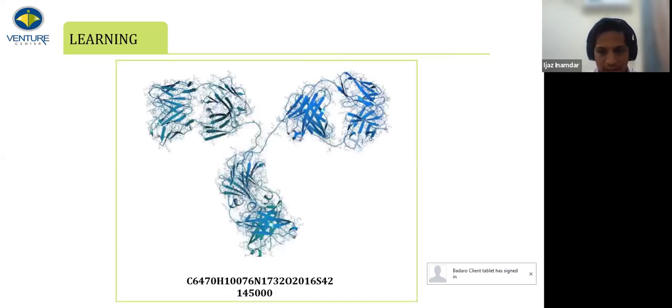And what is the learning at the end? If everything goes well, at the end of the session you will understand how a complex molecule like this, a typical molecule that we get in our laboratory for analysis, can be studied. It's a monoclonal antibody, a very big molecule, as you can see from the molecular formula as well as the weight. We would understand how mass spec can be helpful in confirming the structure of such a large molecule, so you'll have a general understanding of the utility of mass spec with respect to a slightly complicated molecule.